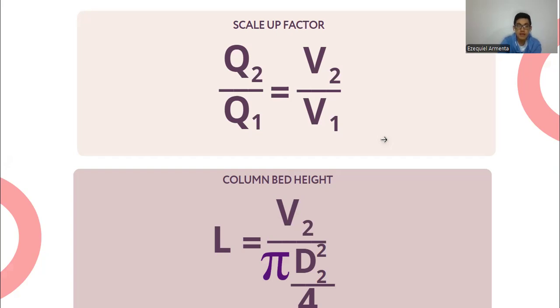Once the dimension of the bigger column is established, we need a stationary phase, so we can use silica gel for this. Then we adjust the flow rate based on the column diameter, and we must determine the maximum loading capacity so that we can dissolve crude beta-carotene in the mobile phase, or a compatible non-polar solvent like acetone. So we can use a liquid loading or a dry load that is absorbed on silica for a better separation.